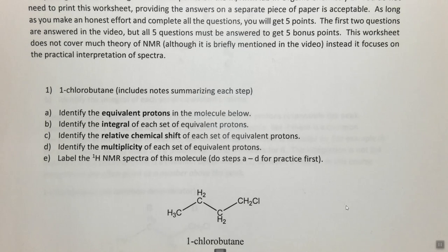Interpreting NMR is extremely useful. NMR is actually how MRI — the medical imaging technique — works as well, so it does have practical applications. I don't want to get too much into the theory because this isn't meant to be a two-hour lecture; this is simply meant to be: how do I do this?